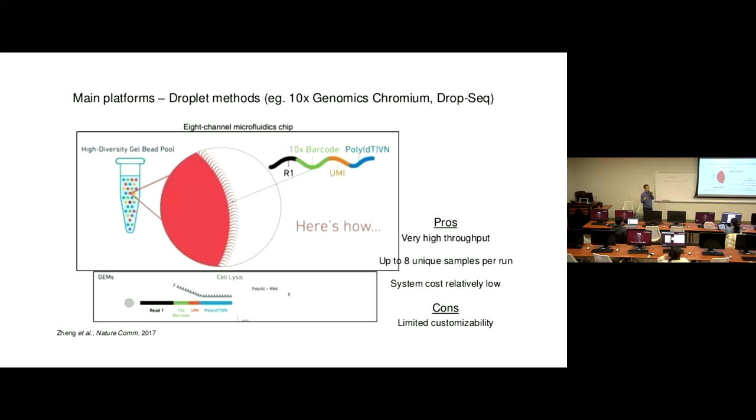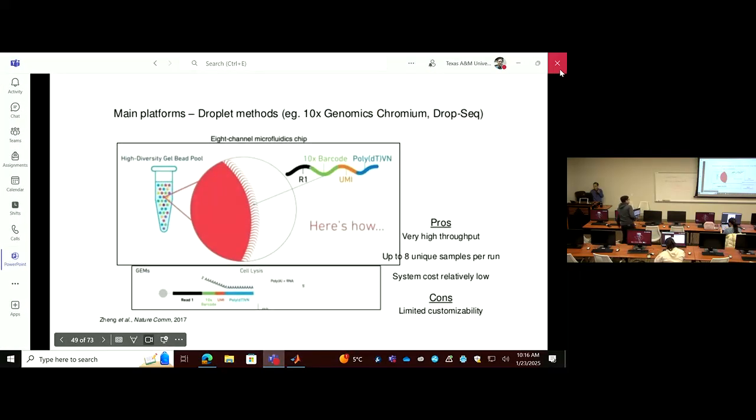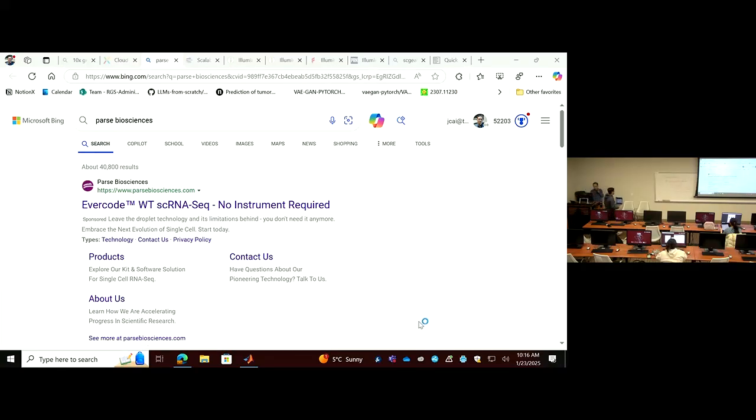Now I will invite Sharon to come here, and he will provide example FASTQ files. How many? Two files. One FASTQ file, two reads. It should be on Teams. If you are all logged in on Teams on this machine, I have sent a link there, and you will be able to find the files that I want you to download for this tutorial. Just let me know once you get the message. I can wait.